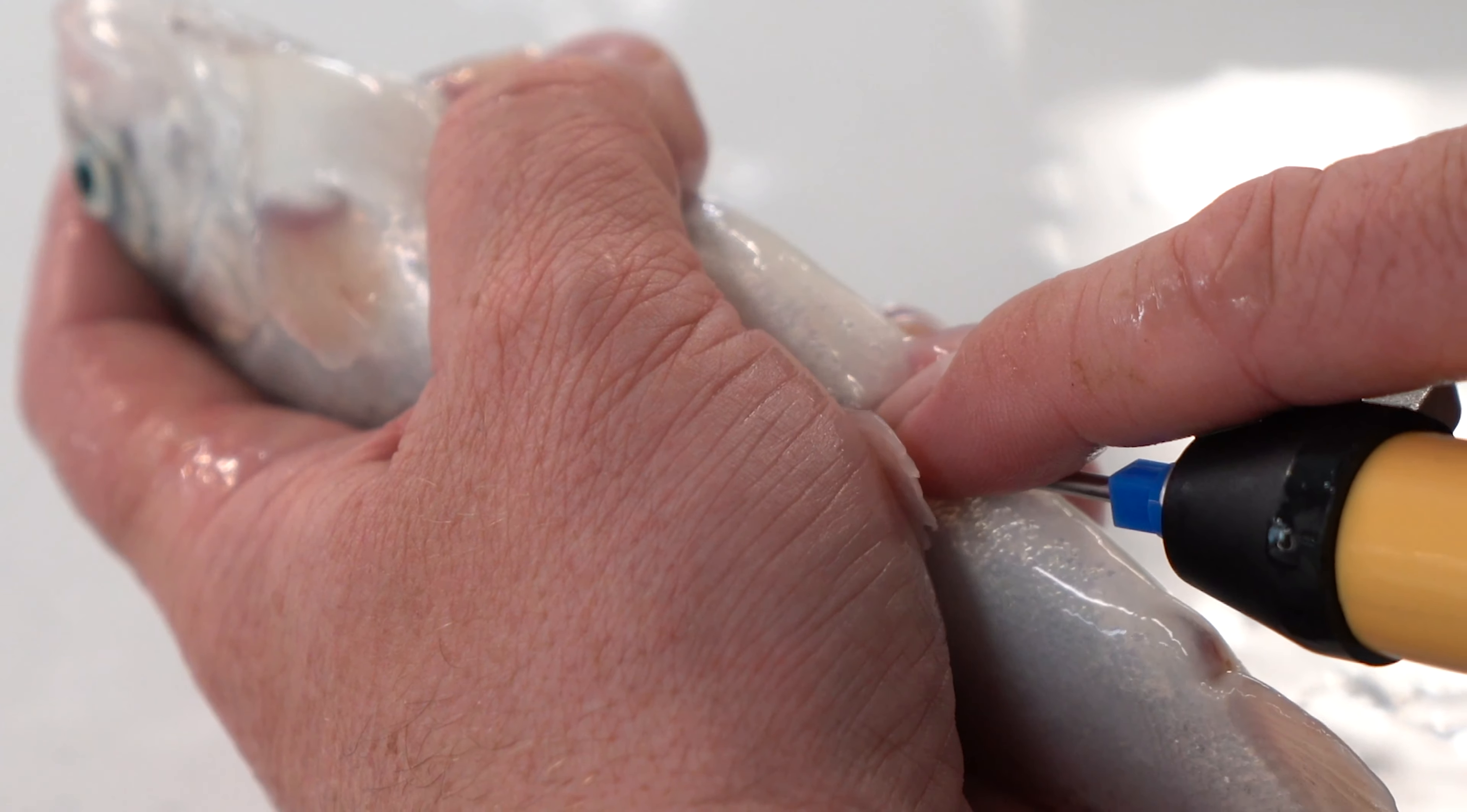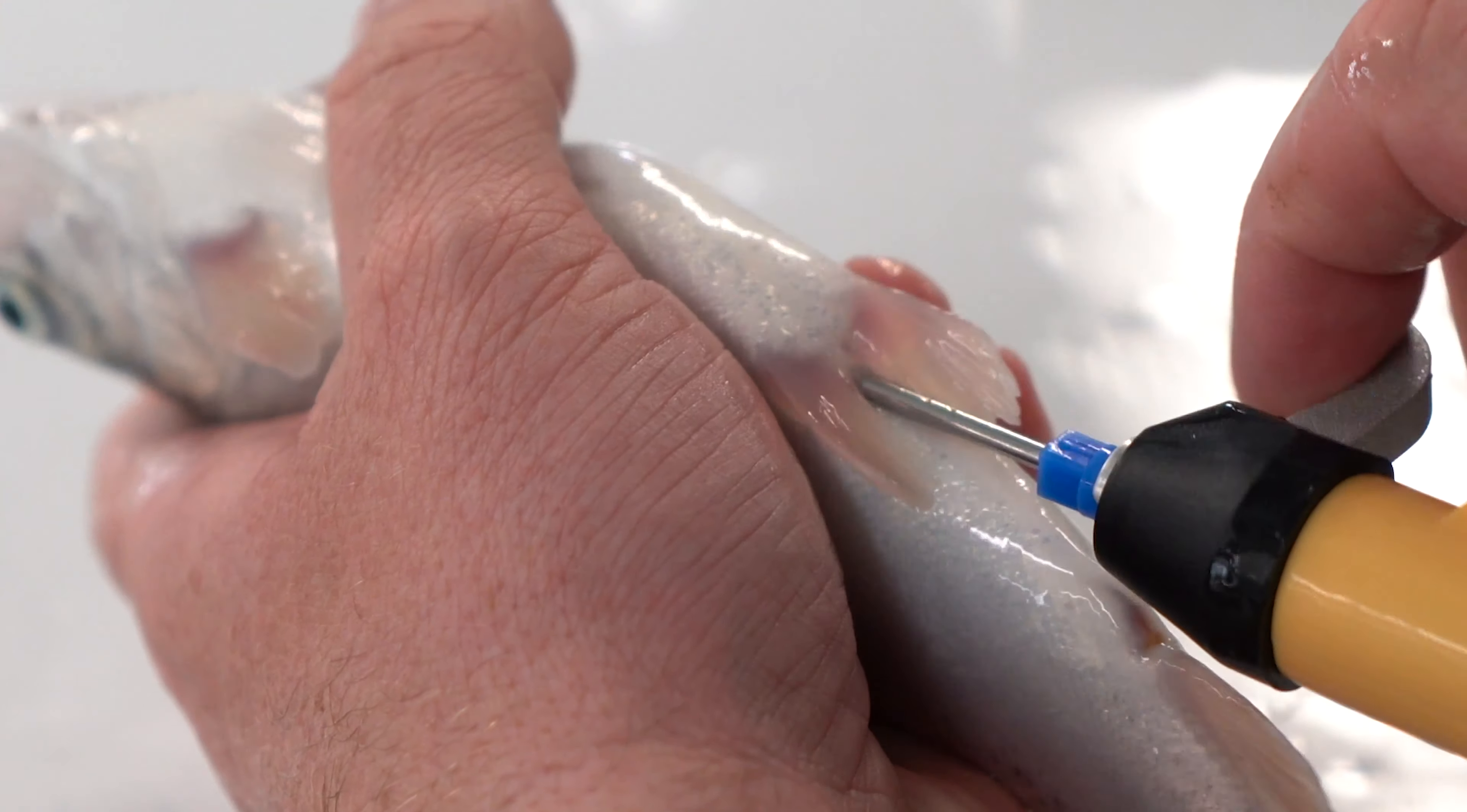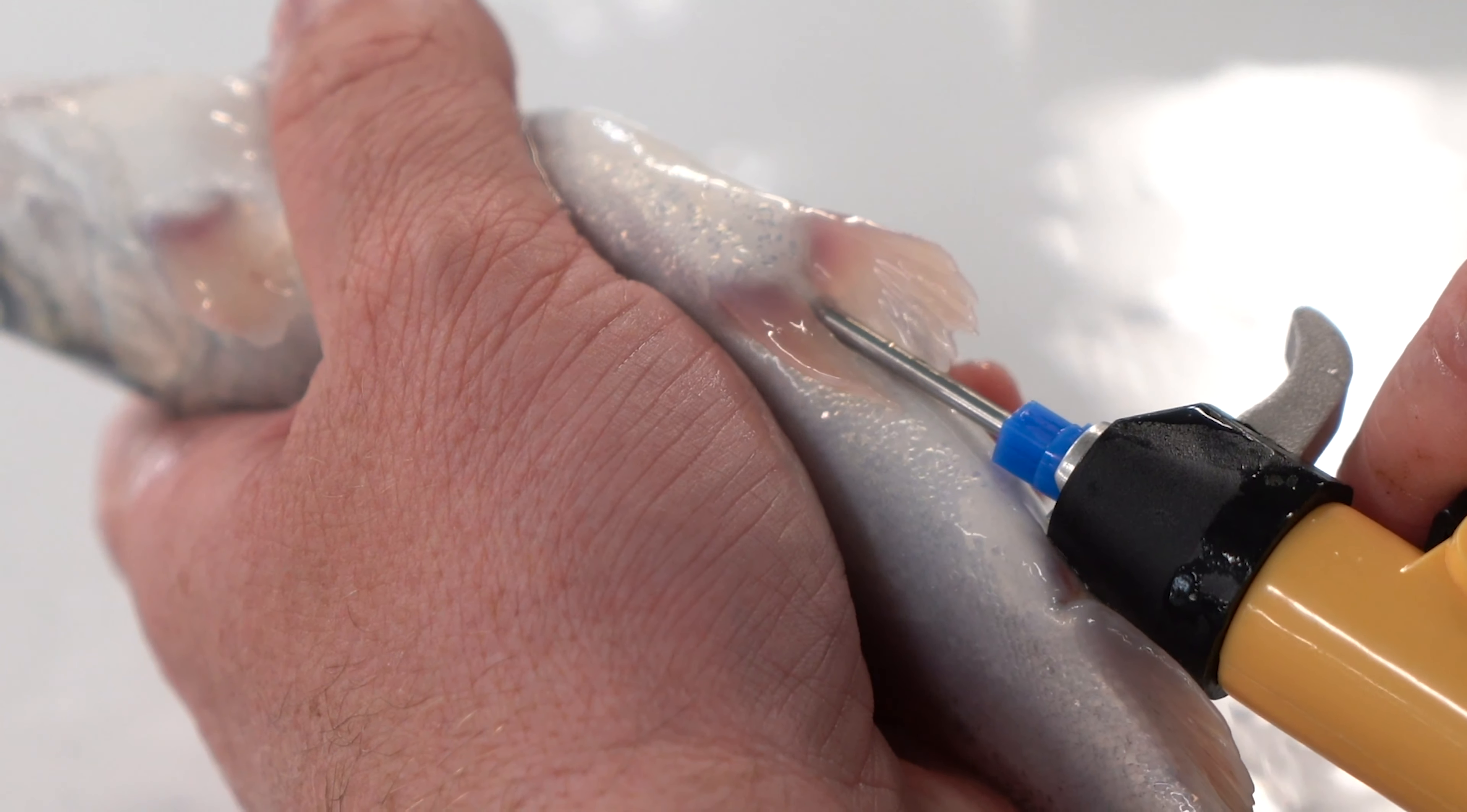While injecting the pit tag, begin removing the needle simultaneously to prevent the tag from being inserted further into the musculature.